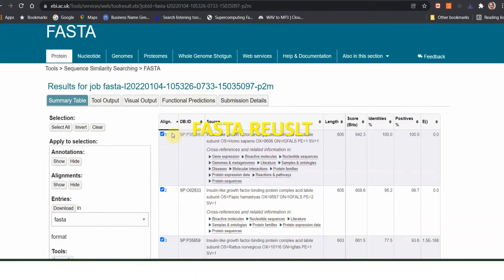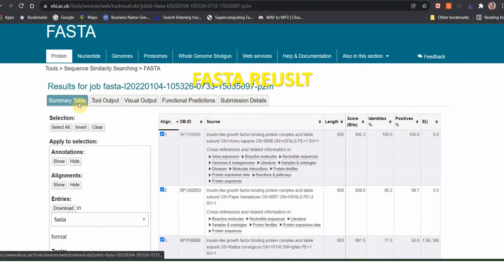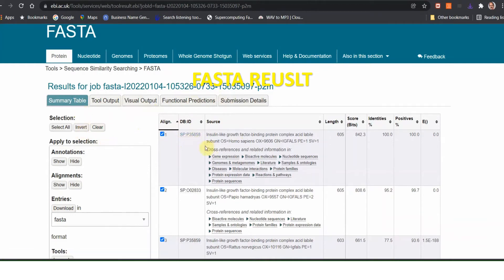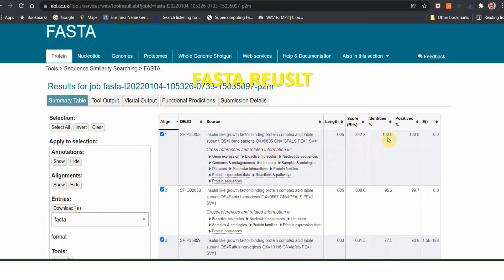I got the result here. In the result section, you will see a summary table, tool output, visual output, functional prediction, and submission details. In the summary table, you can see the different similarity search results. The similarity search showing 100% is ideal. You can select that one. Otherwise, if not 100%, select the nearest one with the highest value and proceed with further study on this sequence.